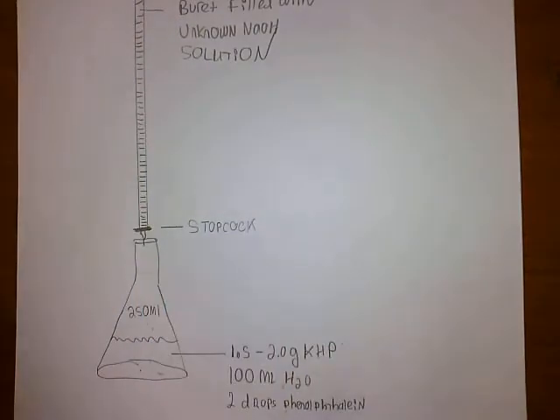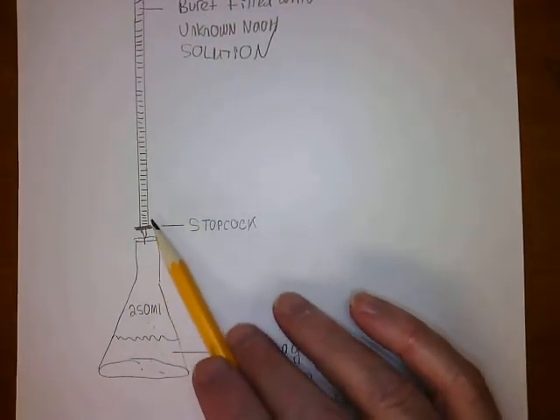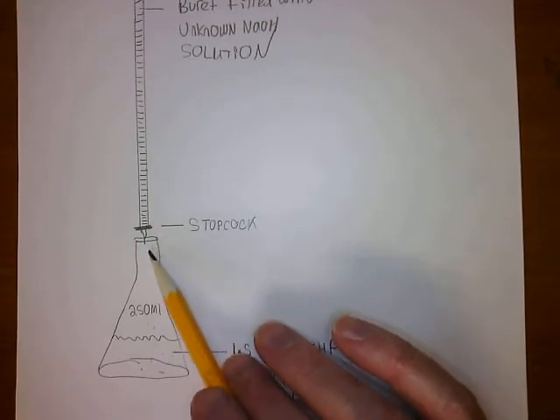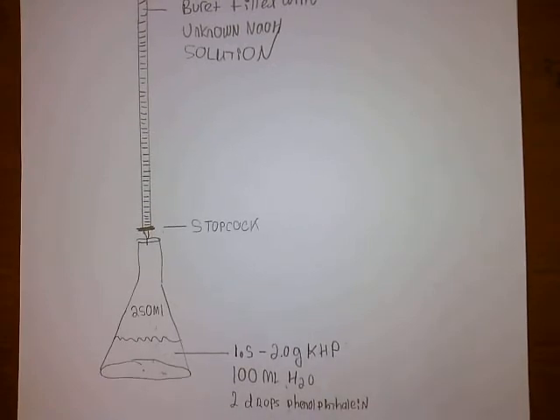Open is parallel. Alright, so when you start the titration, you'll want to open this up carefully, just a little bit, until you get that rate of about 1 drop per second. And that pretty well wraps this up.